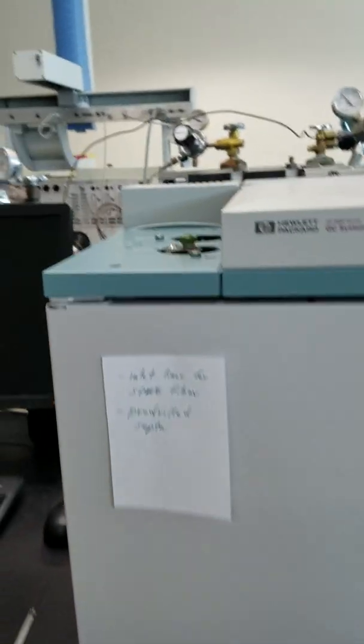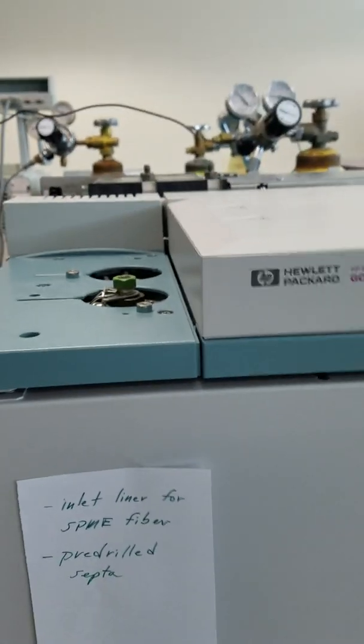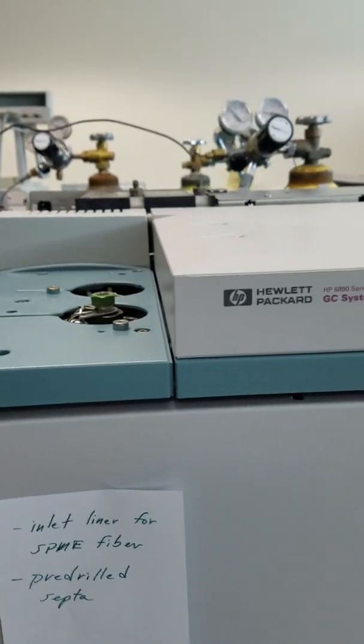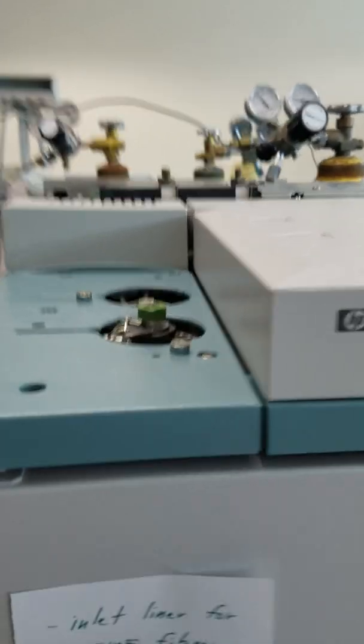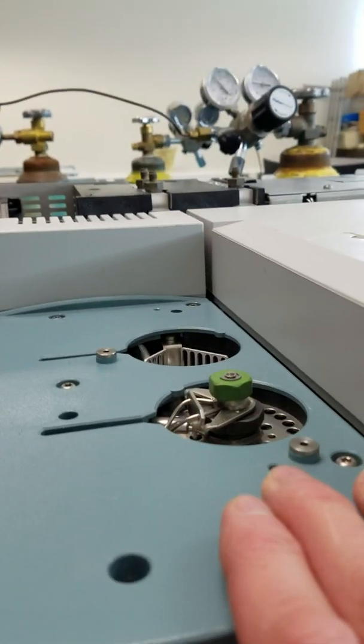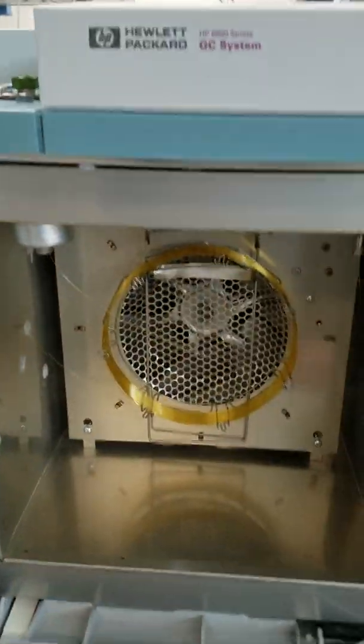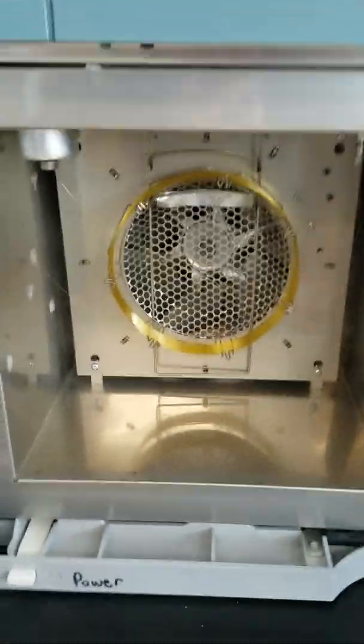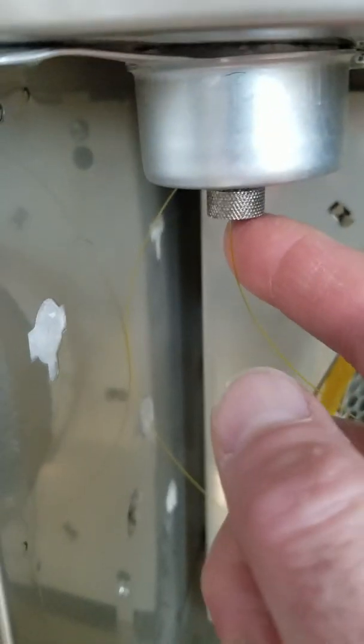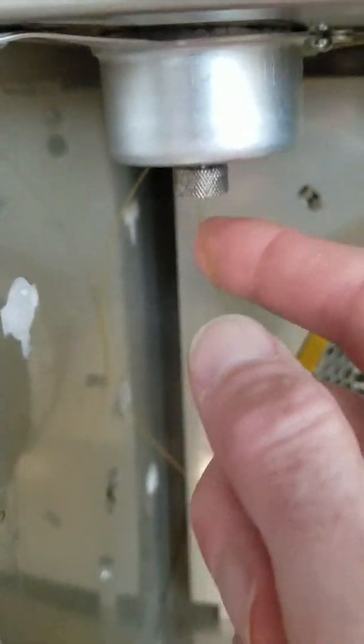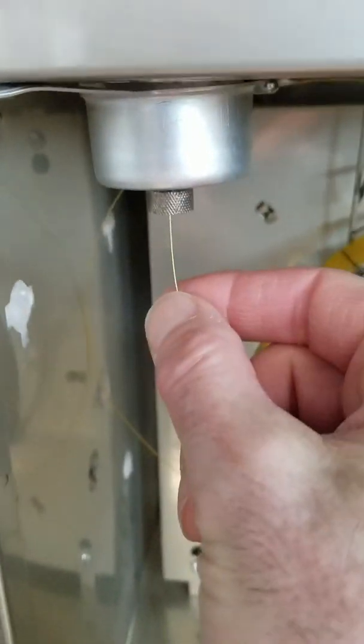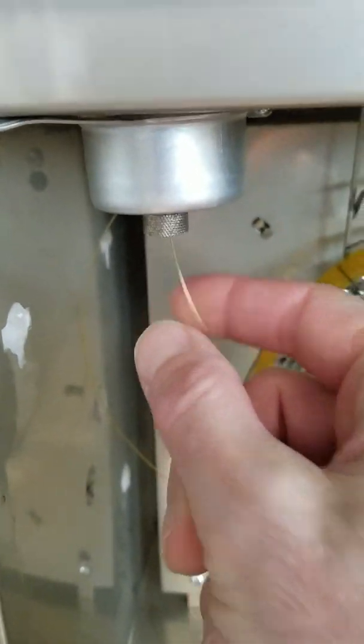I want to go through the components of this GC instrument. We have an injector here which goes into the actual oven. You have this whole inside space here that's an oven. Inside it is a capillary column.